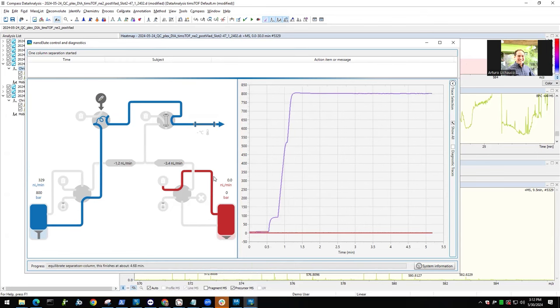Yeah, and the system is now ready, or it's done with the injections of those ones. There should be no volume left. If you compare it to position 4, you should still see 2 microliters in position 4 and nothing in position 1. It's always hard to see. Sometimes it looks like there is no sample, but it actually took the 2 microliters which we have specified.